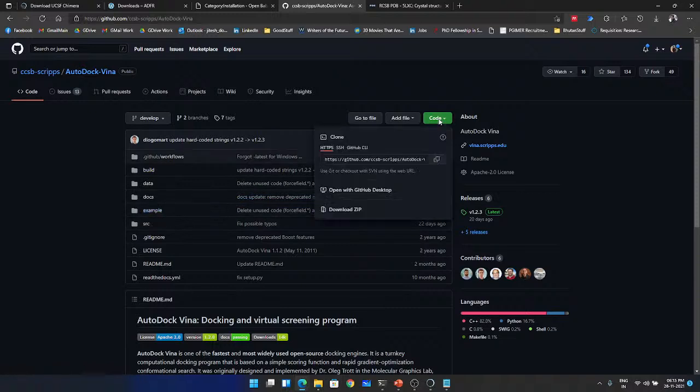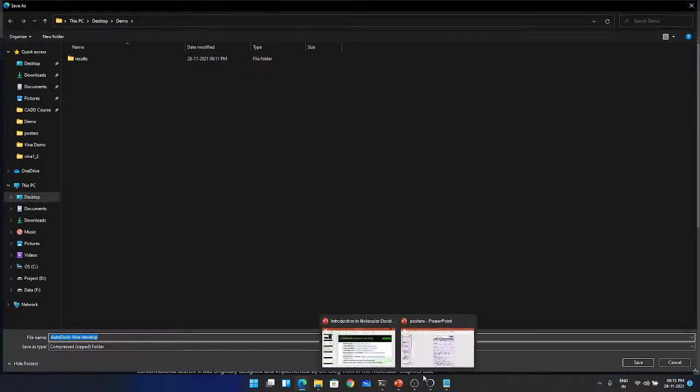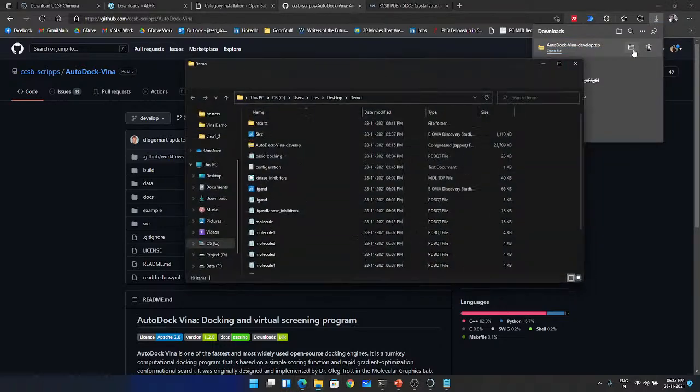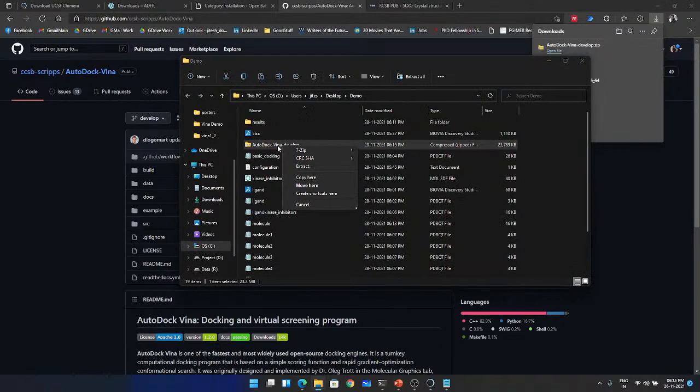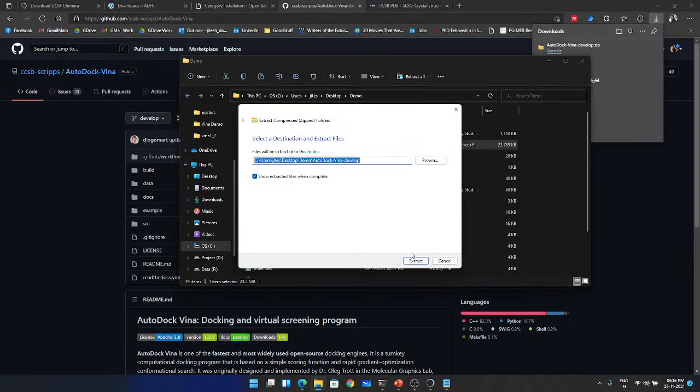So what I'm going to do is download this entire zip folder into our demo folder and show you if those are important. It's a very small set of ready-made scripts. I will also explain what these scripts are used for and what can be done. This is a zip file, so I will extract it over here in the same demo folder.